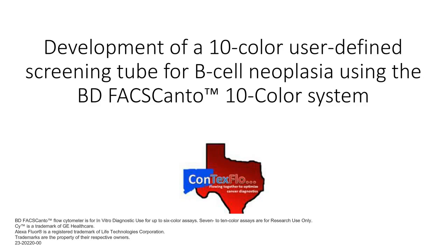You want to see lack of staining in populations that should not be expressing the antigen and vice versa. And I'll say that most of these antibodies, if not all, I can't speak to each one specifically, have gone through the whole process as part of the CD nomenclature workshop, and were identified as binding to these molecules via that workshop.